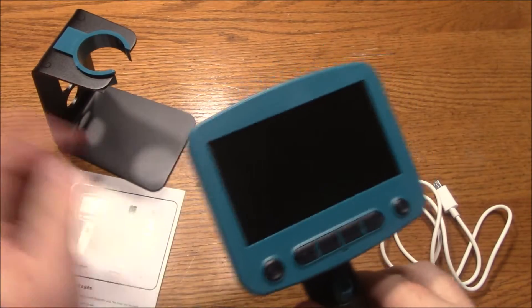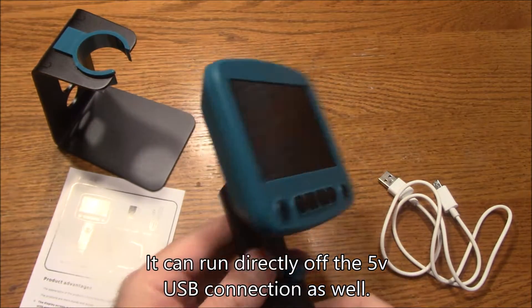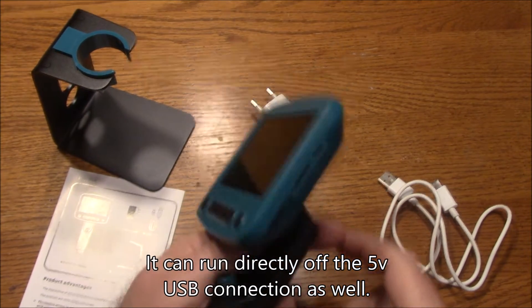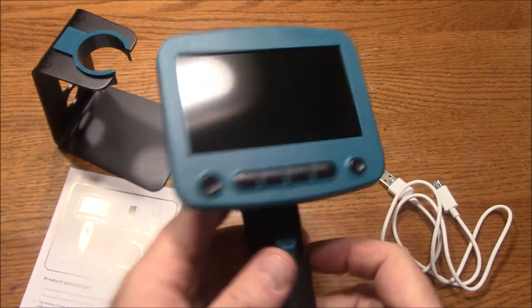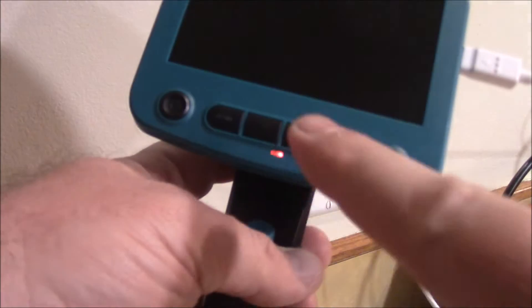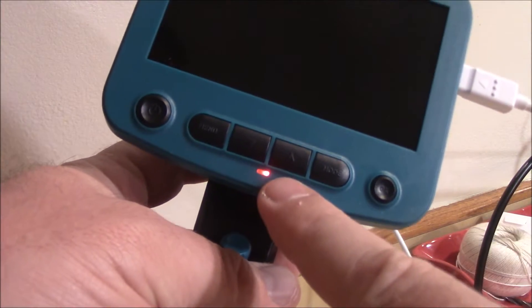Now this does have batteries inside of it, so it has to be plugged in and charged up for a while. It's kind of a pain at first, but the nice thing is, once it's charged, you don't have to worry about keeping it plugged in. When you plug it in, there's a little red LED on here that indicates that it's charging, so we'll just need to wait until this goes off and then it should be fully charged.